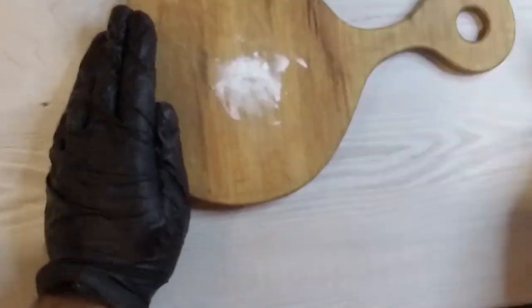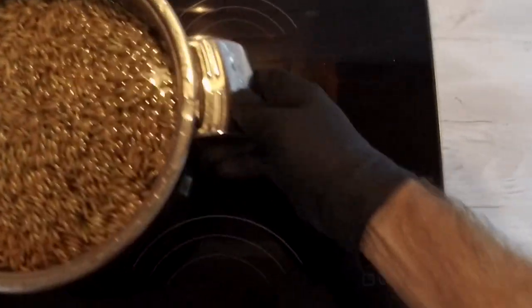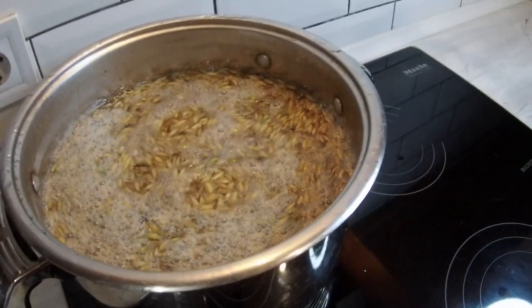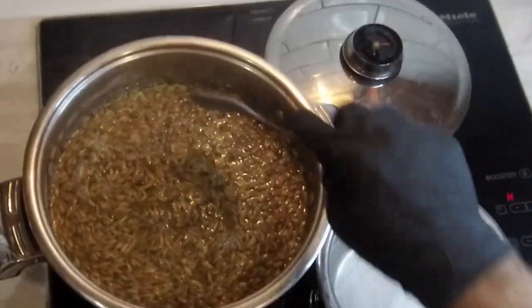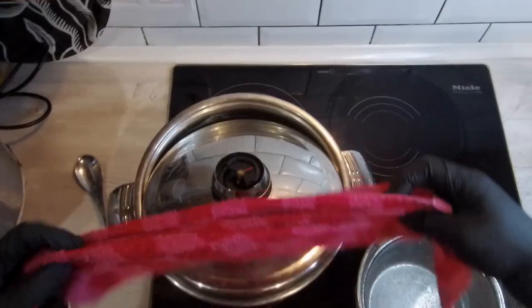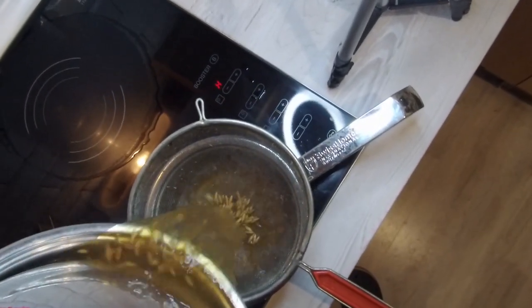Now we're going to boil the grain. As soon as the water comes to a boil, we decrease the heat and let it simmer for 20 minutes. After 20 minutes we can stir and strain the grain, but don't discard the water — you can use it for preparing agar.